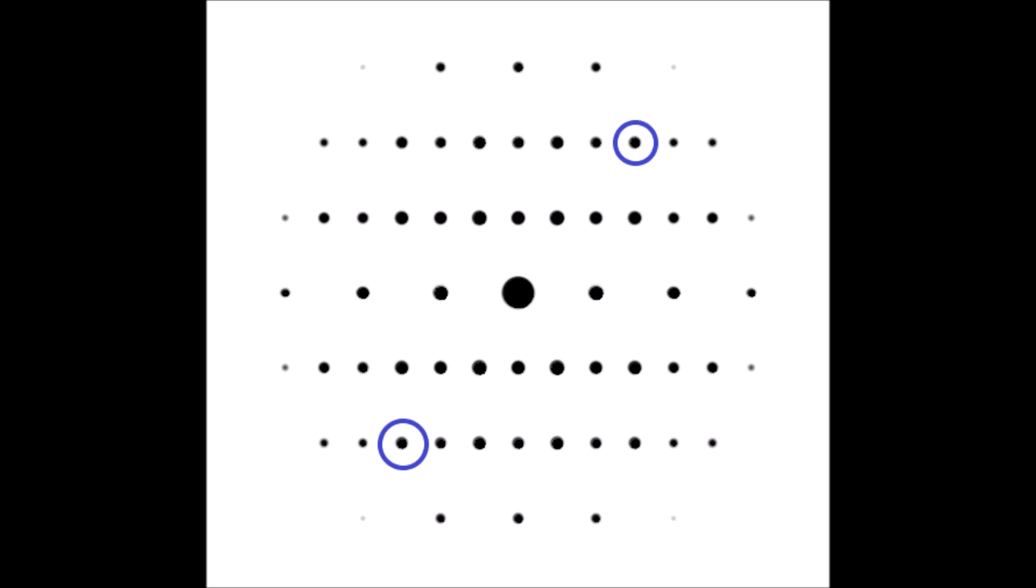So the question then becomes, what does the diffraction pattern look like if I'm not aligned with the zone axis? Instead of seeing this symmetry in the intensities of opposing spots, I no longer see that across the whole diffraction pattern.